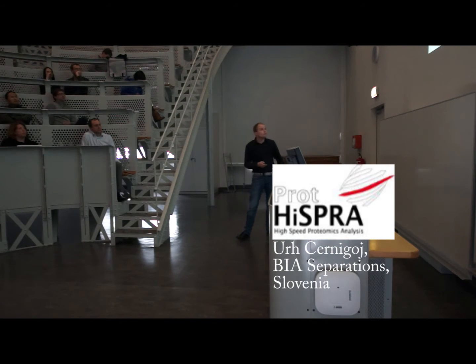And actually, there were quite some experiments tested, and this is, for example, the SEM picture of one of such monoliths.